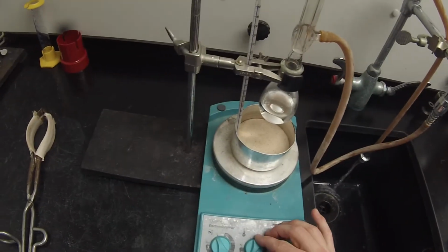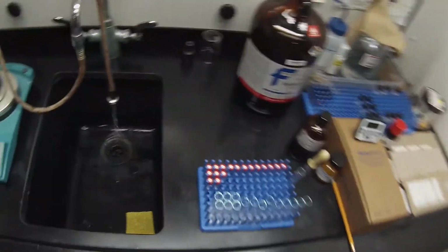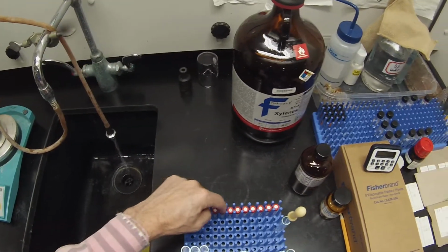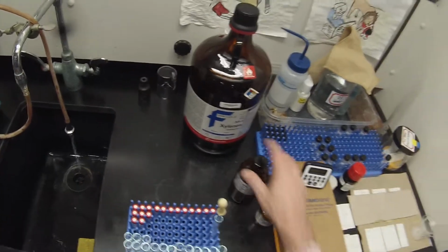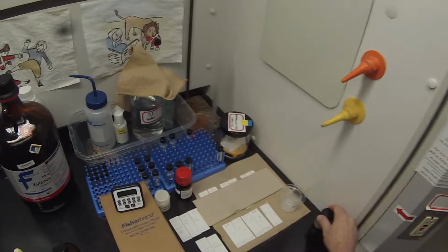Above 150. I'm going to just turn that down very slightly. I want to maintain a constant temperature. So I have 54 A, B, C, D, E, F, G, H, I, J, K, L, M, N, and O, and then here A, B, C, D, E. So this tube will go in there eventually. And then these two are my crude and purified product. This is my pipette for the methylene chloride. I don't need the potassium carbonate or the para-toluenesulfonic acid anymore, so I can put those back where they belong.